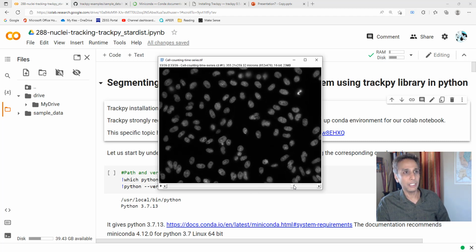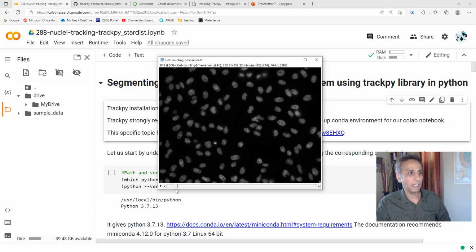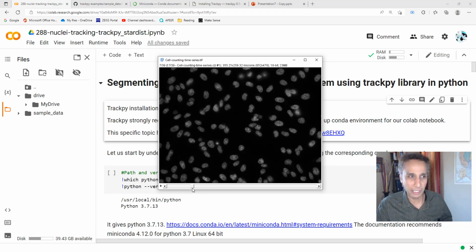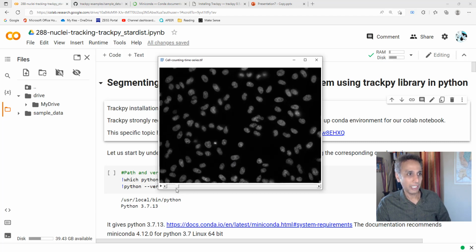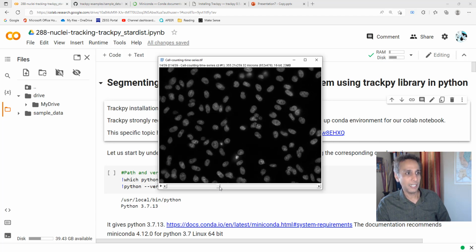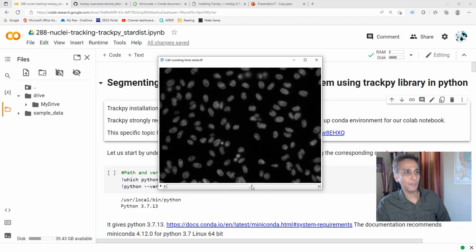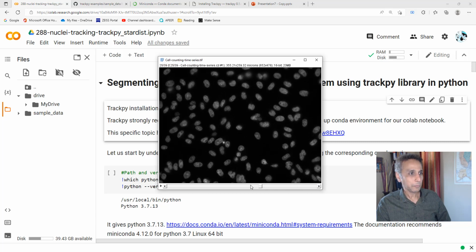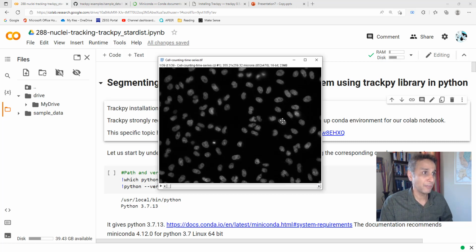It's broken down, and there you go, it's gone. Most of those are there, and there should be another one. I love to see this. This is amazing. This is life happening. Look at this. You can kind of tell something is happening with that nucleus right there. It looks normal. There you go. It decided that it wants to divide and become two different nuclei. Isn't that amazing?